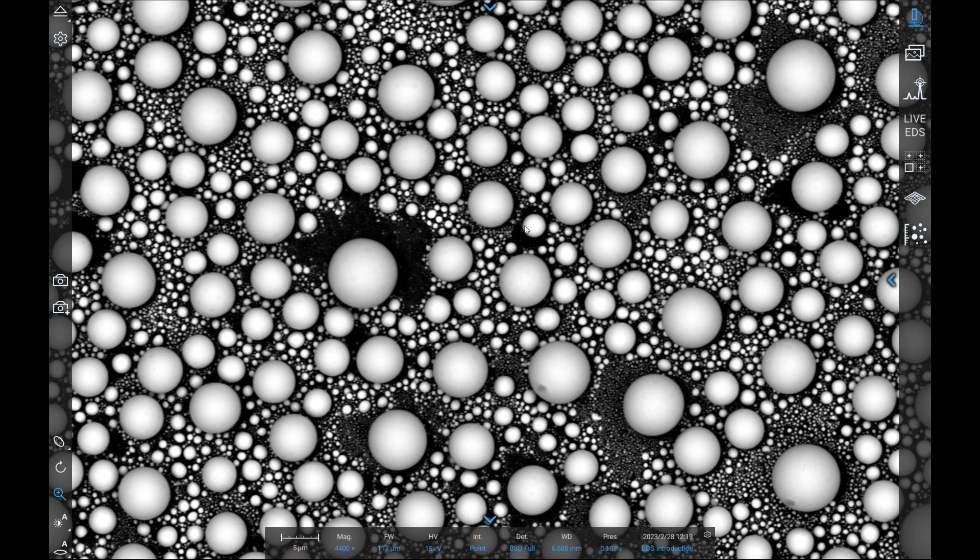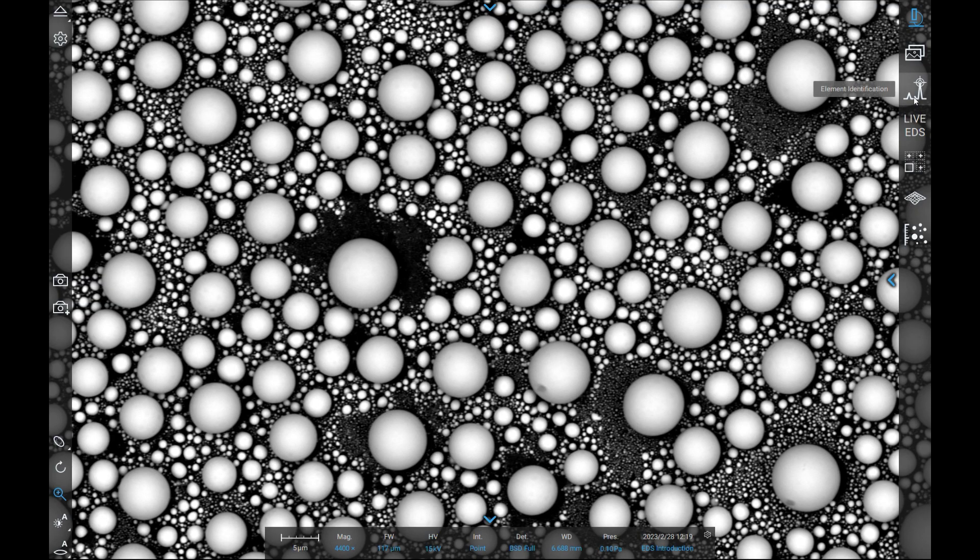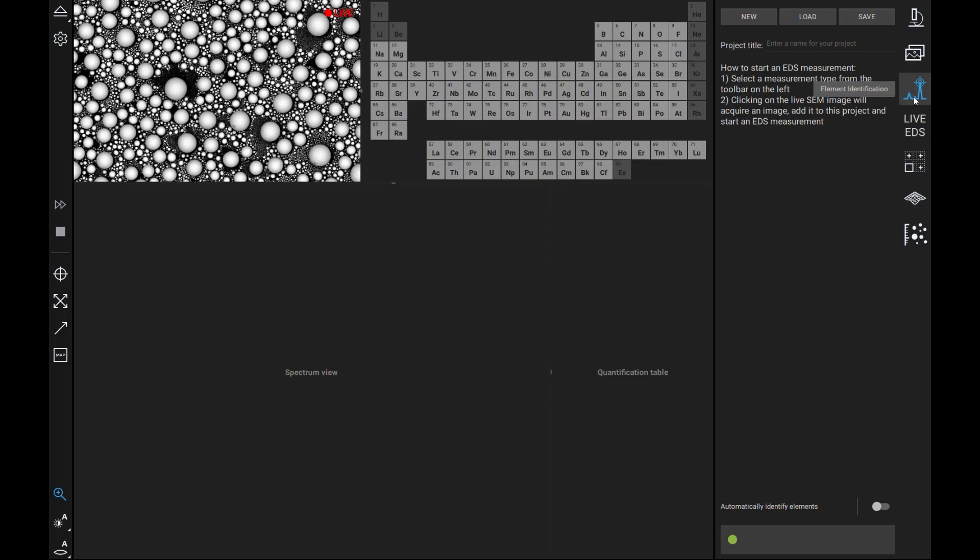To begin, select the spectra icon on the right hand toolbar of the user interface, and this will bring up the fully integrated EDS software. In the top left corner will be the live image. To the right of it will be the periodic table. At the bottom of the screen will have both the spectra and the quantification table. And the right hand side of the screen will display both the images and the measurements taken.